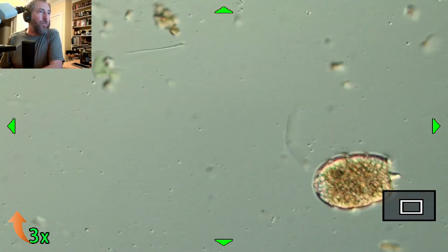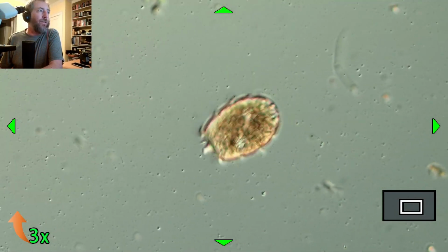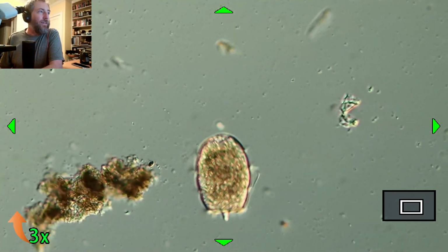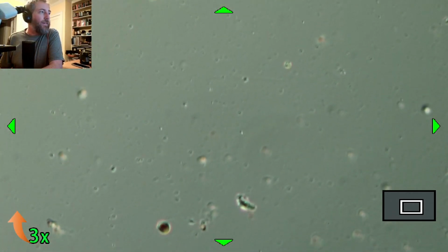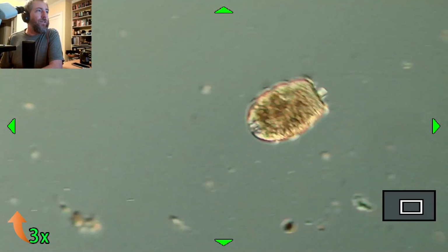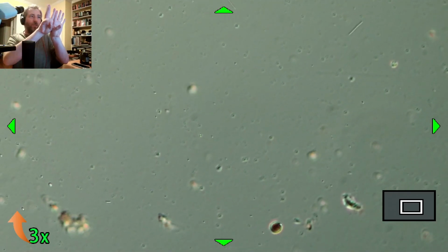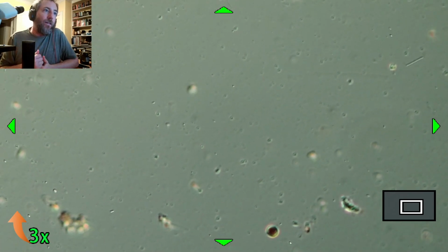It looks like they're spinning because they wave them sequentially, like they're doing the wave at a stadium, like fans at a basketball game or whatever. And it just took off. Oh, it came back. So they don't actually spin. They just kind of do this, but they're doing it like this. So it looks like they spin.